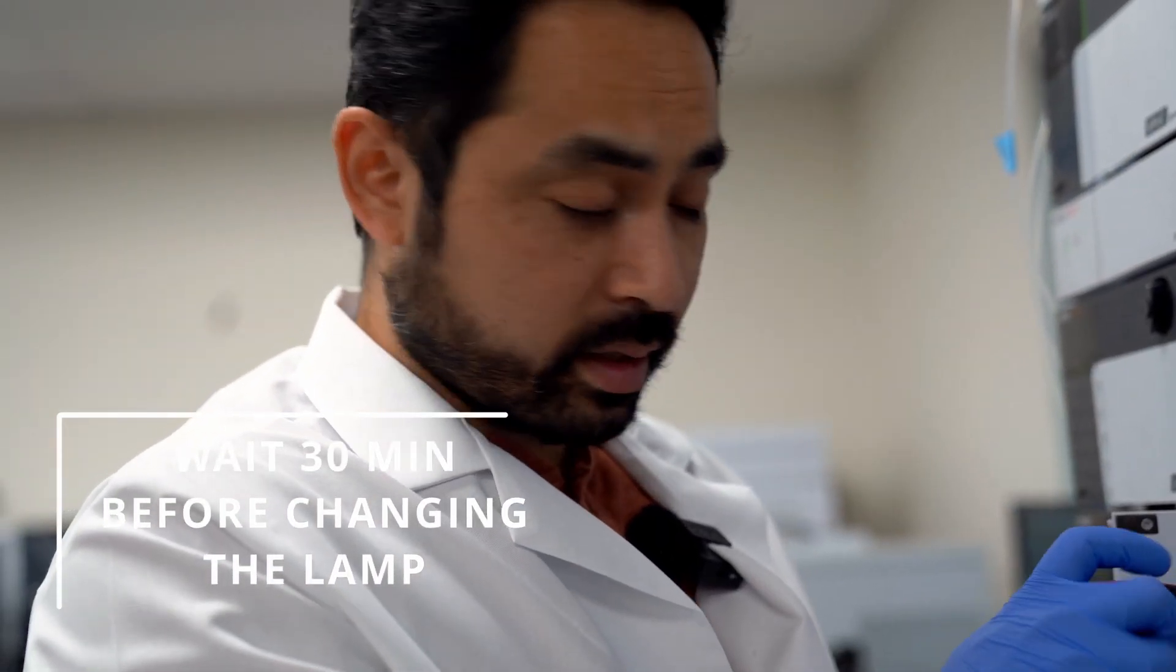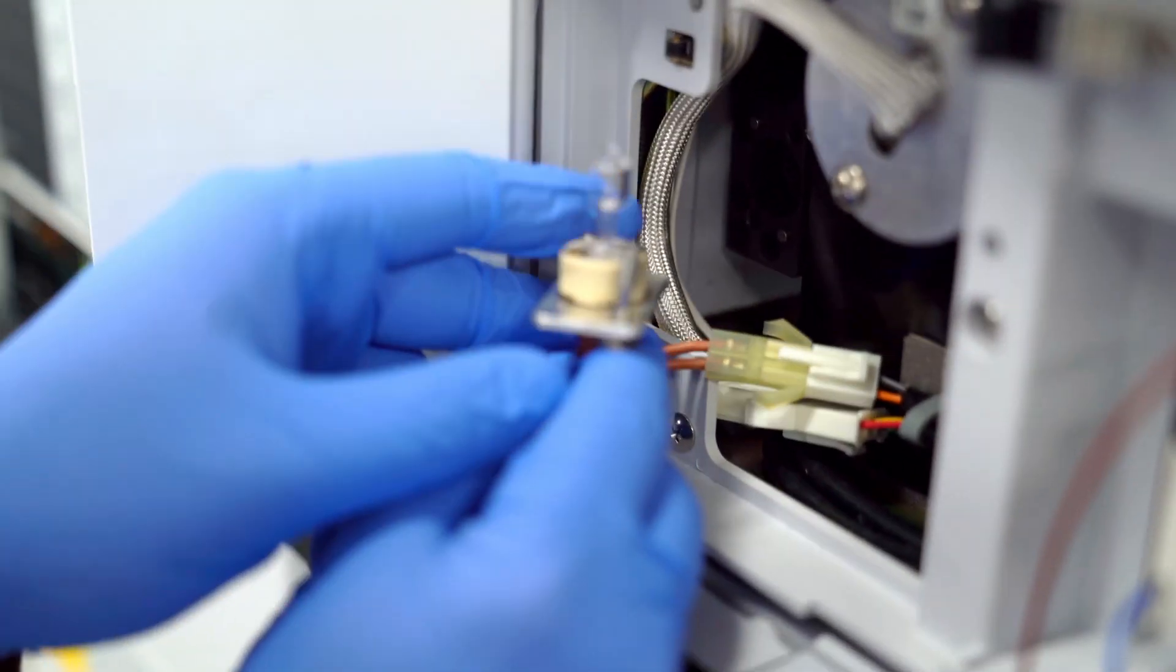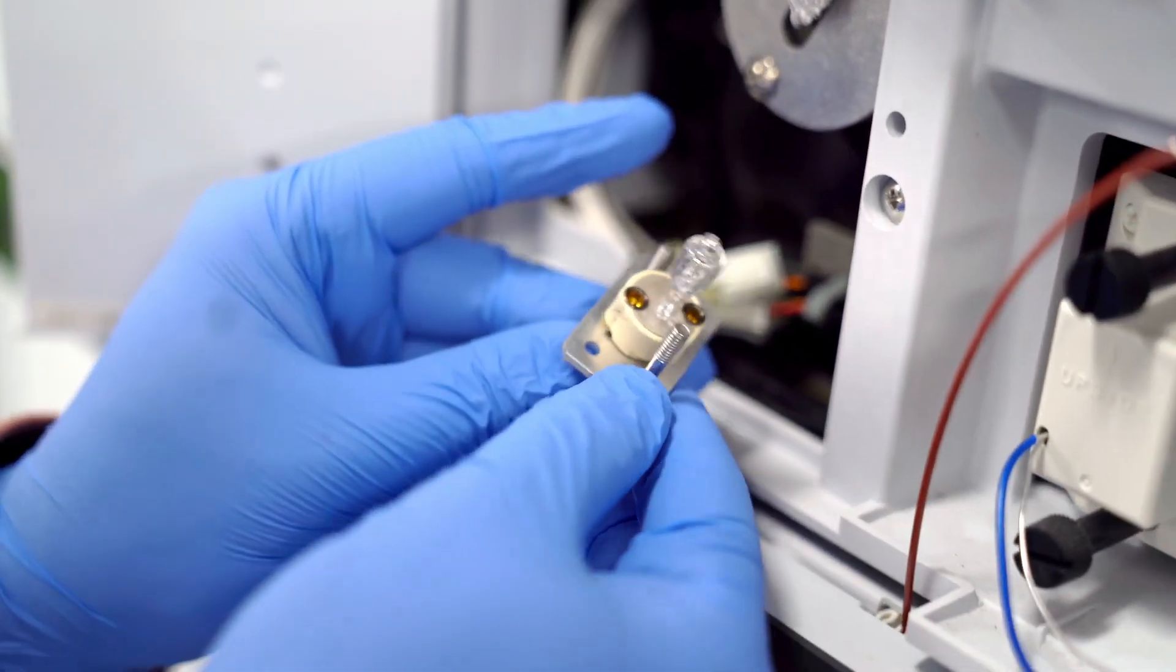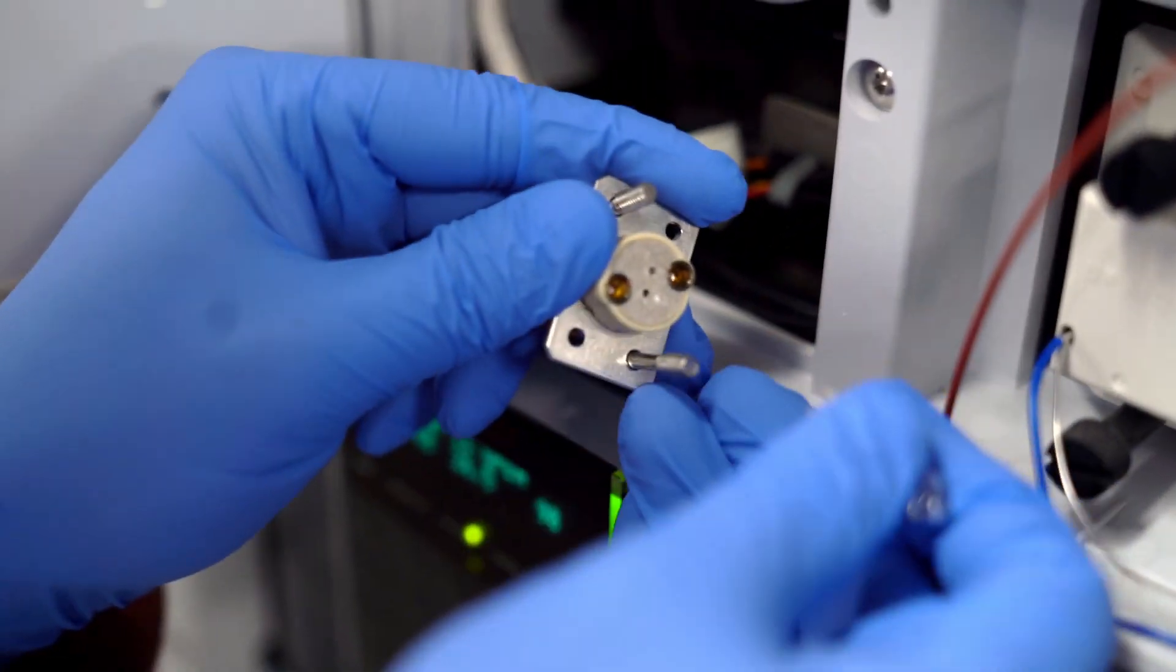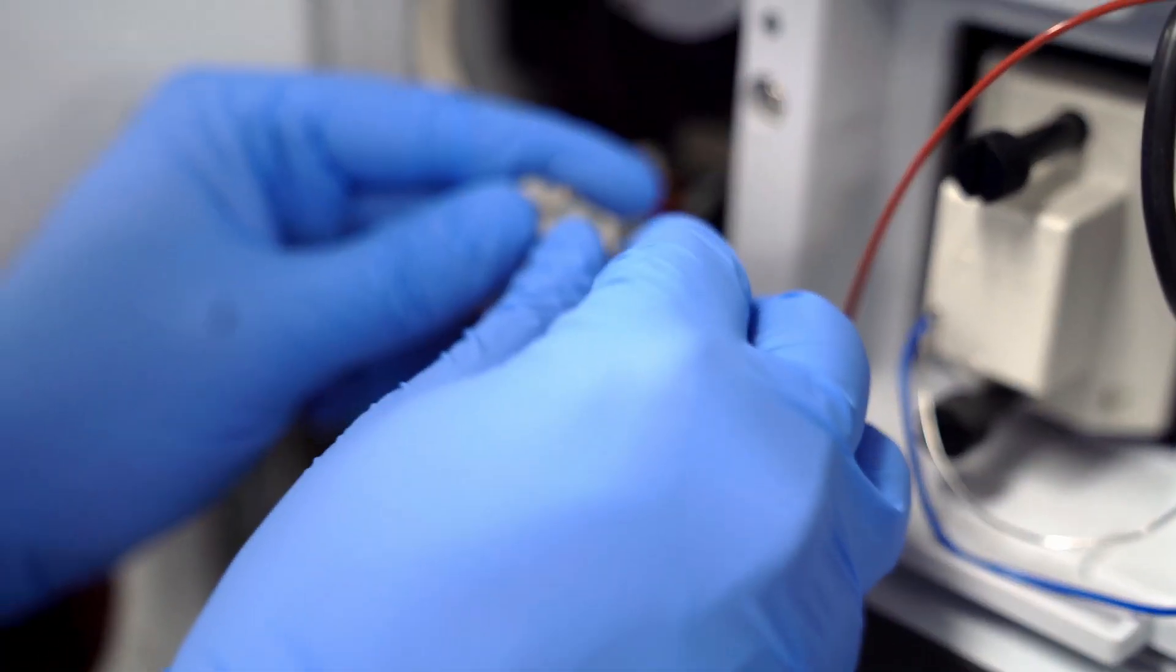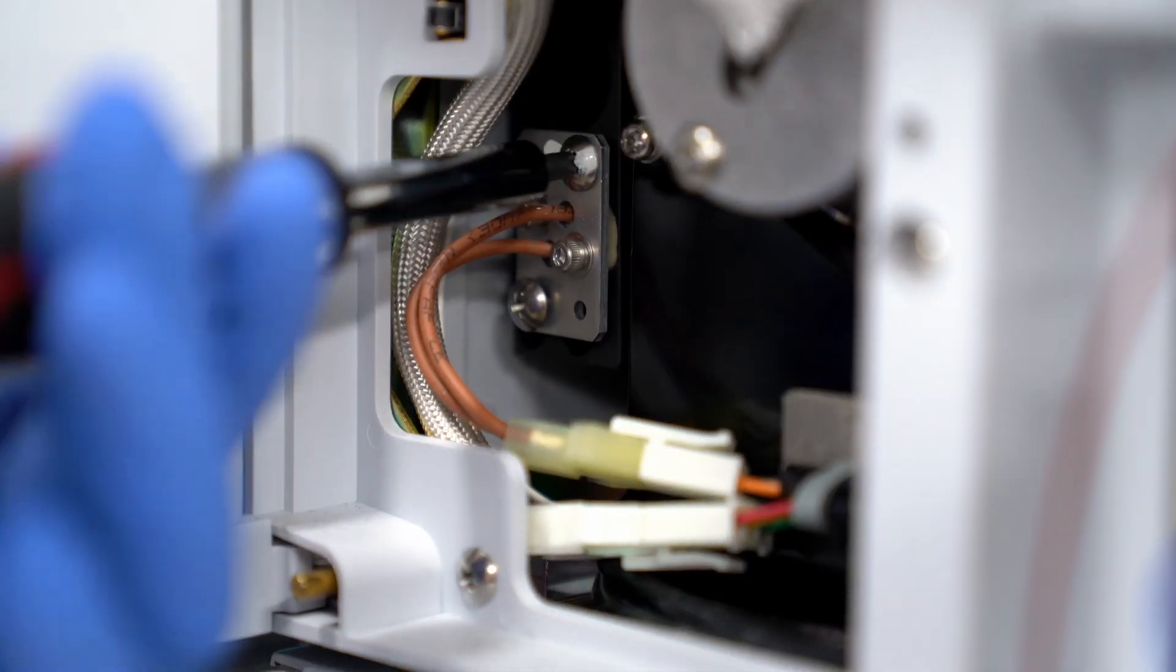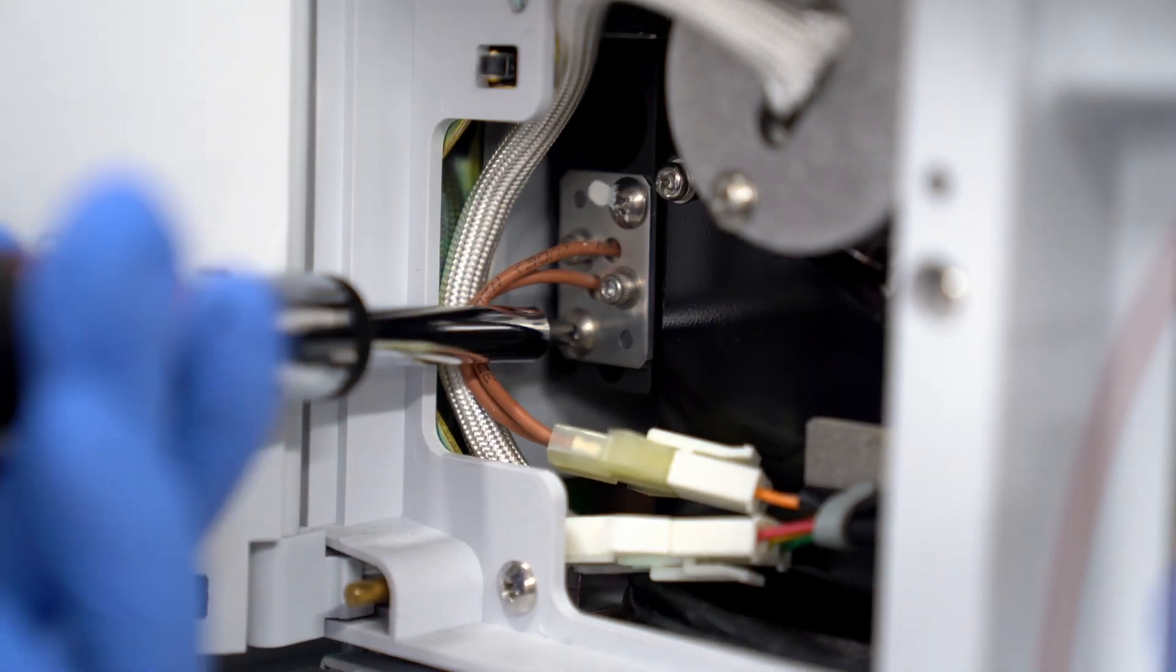After you turn off the PDA, wait 30 minutes. So here is the tungsten lamp, and the way you change it is just like you change a car lamp - you can just pop this guy off just like that. Super easy. That's how you change that lamp out.